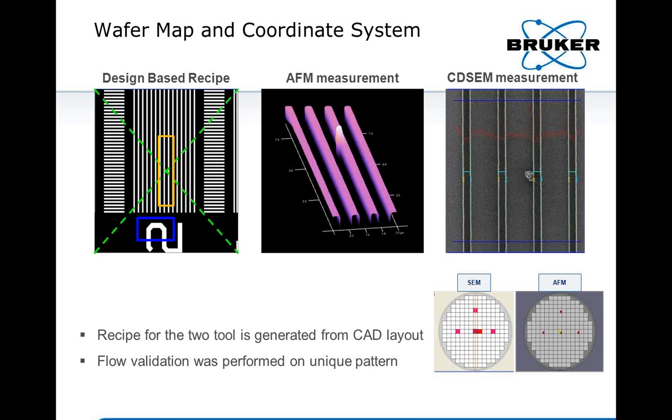This example also clearly shows the benefit of the hybrid metrology approach. The defect in the target is clearly visible in both the CD-SEM and the CD-AFM image. However, the 3D AFM morphology is not clear in the CD-SEM image. Is it below the surface of the lines, above it, or perhaps it is flush? The AFM image clearly shows that the defect in this case is significantly taller than the lines. The combination of this data for both the CD-AFM and the CD-SEM provides far more actionable information than either system alone.